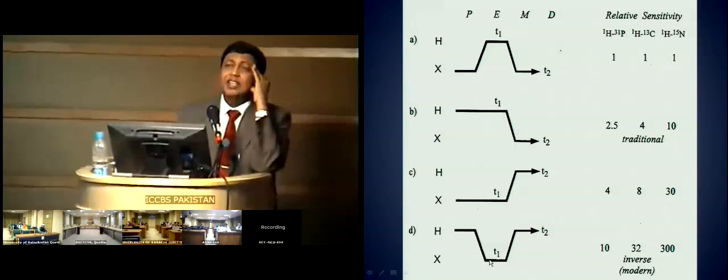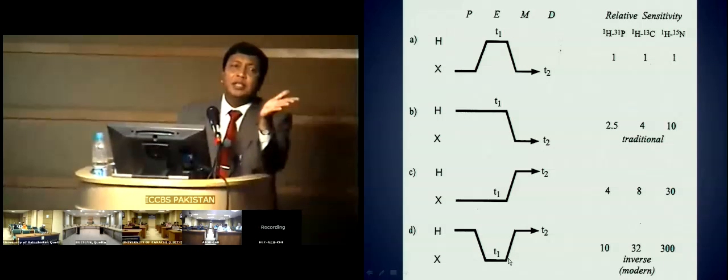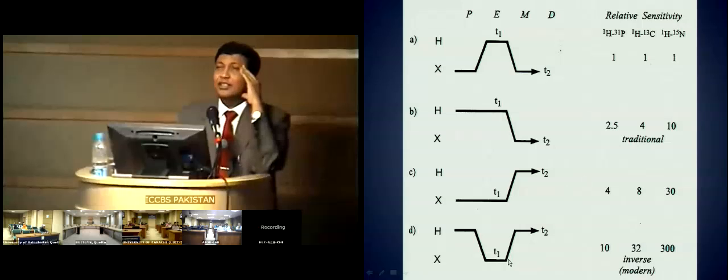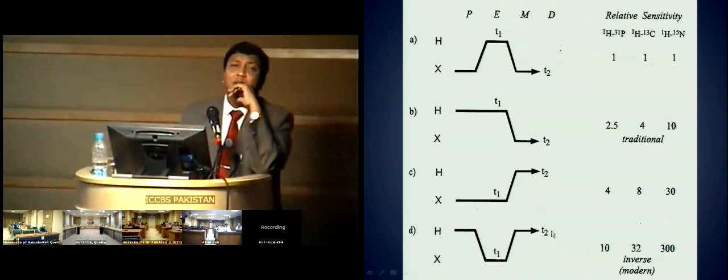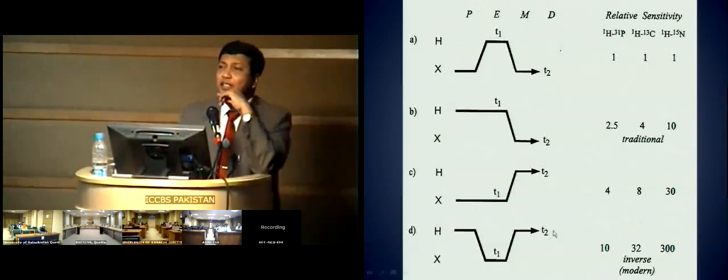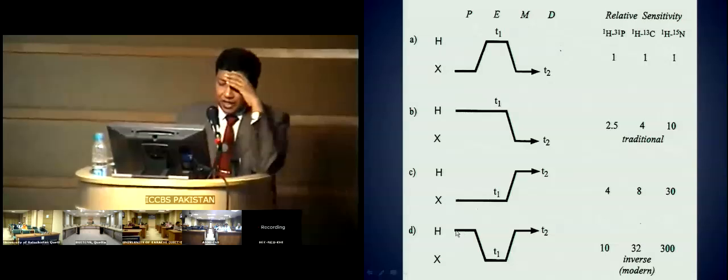So what that means is that you give a 90 pulse, bring it back to the XY plane, let this carbon be antiphase again, and then you do a spin inversion. Same thing, INEPT in the reverse sense. Alright. So once you have this, you transfer it to the proton, and what you detect is proton. The source is proton and the detected nucleus is proton also. Let me repeat it again. This is your 90x pulse.